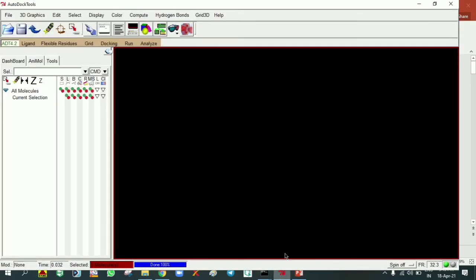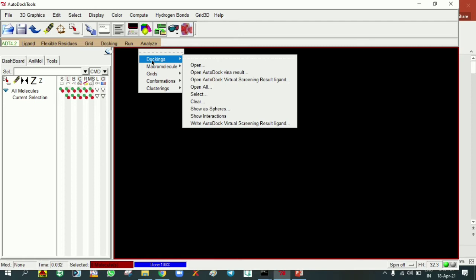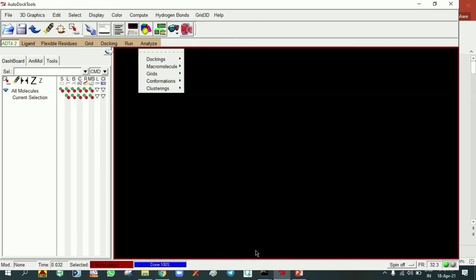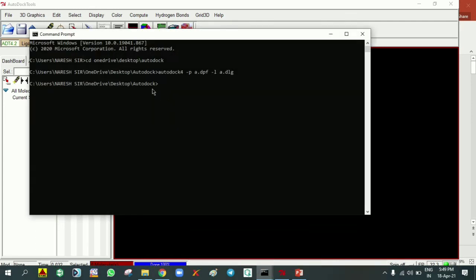Go to AutoDock Tools, then Analyze. After completion of the command prompt given in the previous video, the completed job AutoDock 4 converted the parameter file, docking parameter file into docking log file.